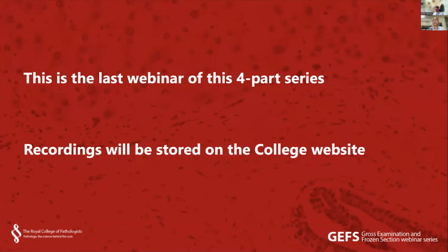But I suppose you'd hopefully encourage your colleagues who might be cutting a specimen up to indicate if they thought there was a separate piece of adipose tissue, maybe a piece of omentum adherent to the outer surface of the specimen at the site of the tumor. That would be helpful. If you knew that was the case, you'd want to make sure that that area had been sampled thoroughly.